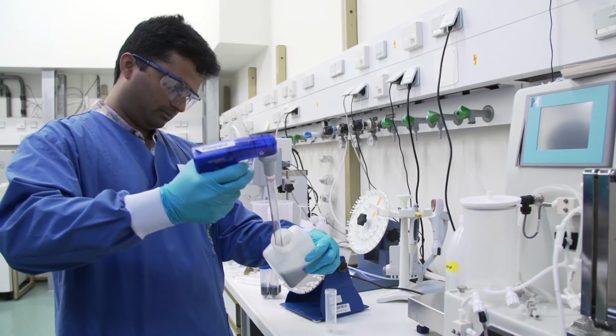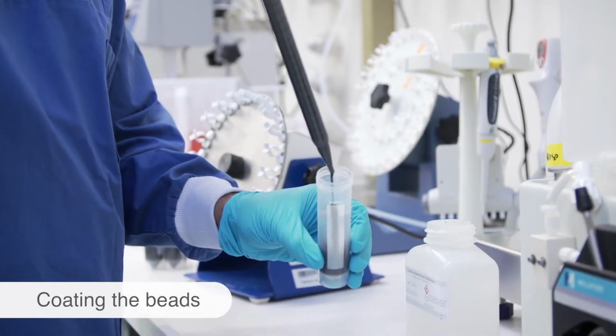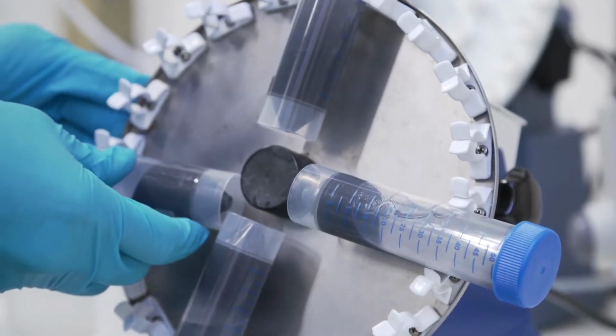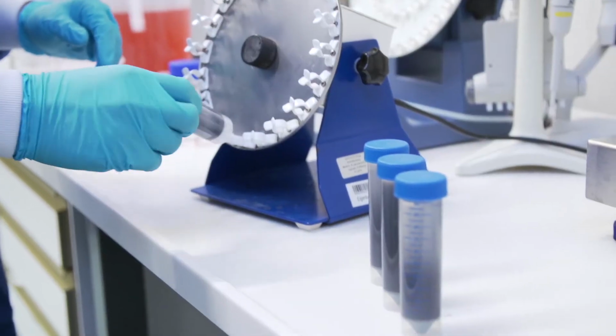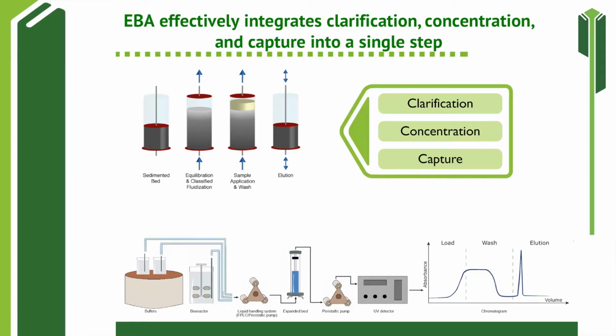Expanded Bed Adsorption, or EBA, is an advanced integrated unit operation for the downstream processing of biomolecules directly from a bioreactor, where clarification, concentration, and purification are performed in a single step. So 3 discrete unit operations, namely solid-liquid separation, volume reduction, and partial fractionation, can be replaced by a single EBA capture step to reduce processing costs and time and product losses.